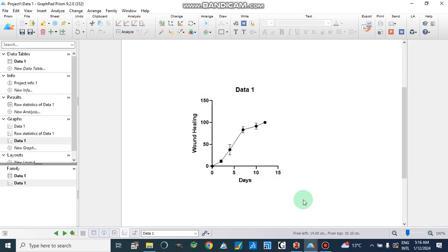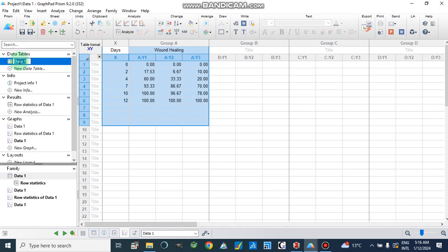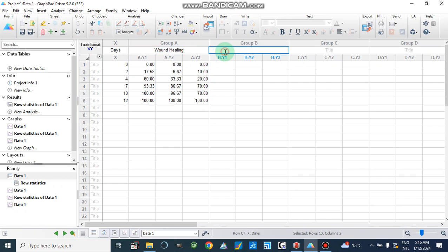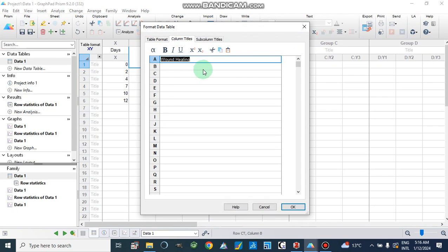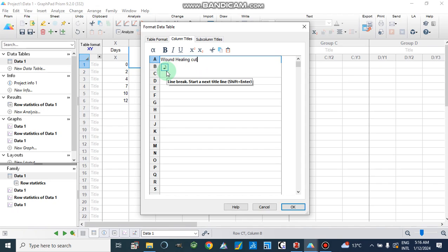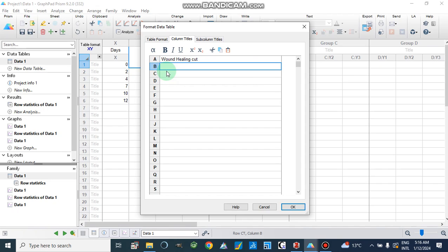If we have more than one dataset — for example, here we have wound healing for some values, and we also have wound healing for infection — we can add that second dataset to our project.